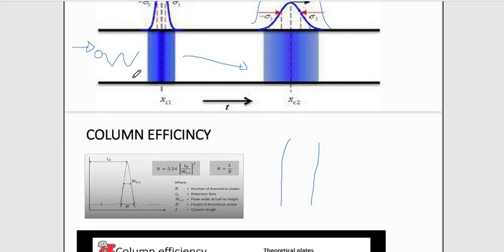It means that for every particular analyte, since the polarity of the silica gel or the adsorbent particle in the column is constant, there is always a discrete distance in which the analyte is equilibrated between the mobile phase and the stationary phase.